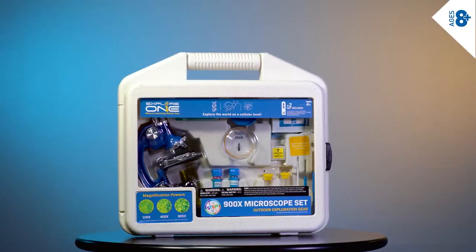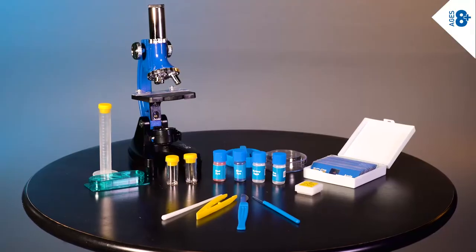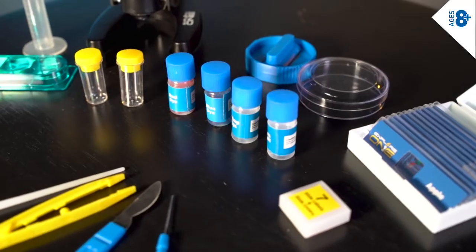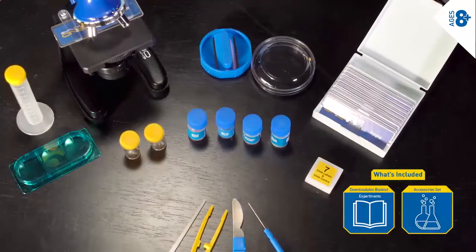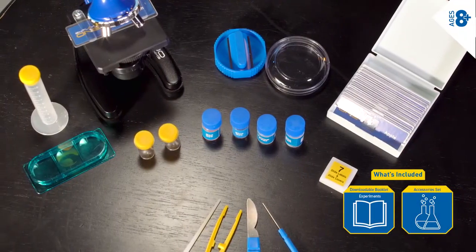The original 28-piece classic 900X microscope now gives you more than 45 pieces in the set. Included are all necessary tools for observing the prepared slides, hatching real brine shrimp, and gathering specimens collected in the field.